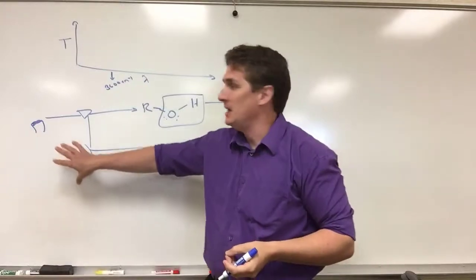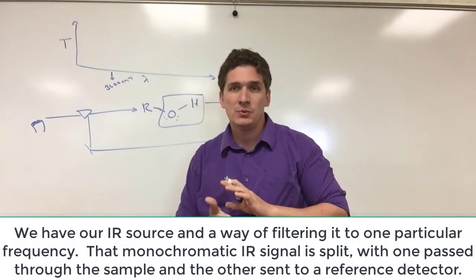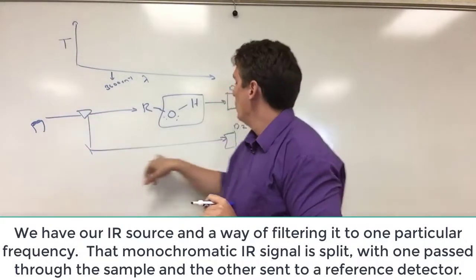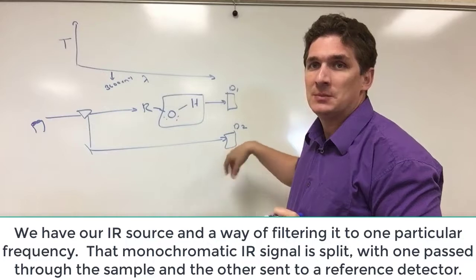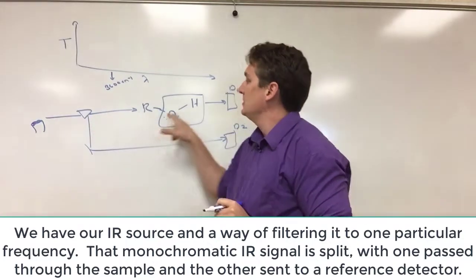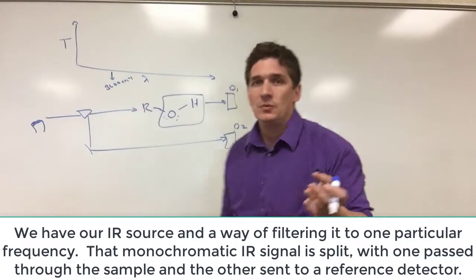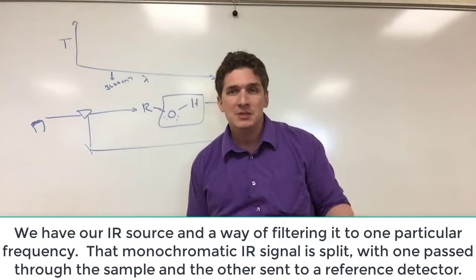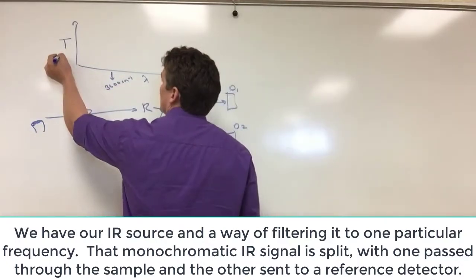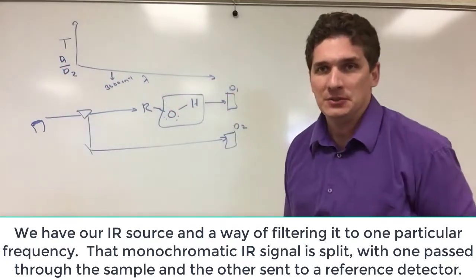What we're going to do is take some infrared source and send our light through a splitter. One beam goes to a detector that's used to determine the intensity of the light coming to the sample. The other passes light through the sample, and then we measure the intensity that comes out the other side. So the raw data is what's called the transmission data. What we're looking at is basically the signal intensity on D1 over D2, detector 1 over detector 2.